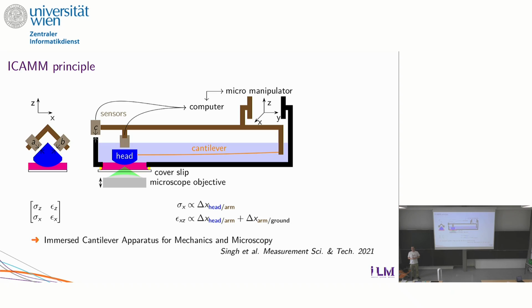A rheometer is usually either stress control or strain control. At least that's what they sell you. But here you can get better resolution in torque. Is that the idea? It won't be a torque. Yeah, it will be, but the resolution in stress will be more or less the same as in the rheometer, but applied on a much smaller area. And this much smaller area corresponds to where we are looking. So the stress is not distributed over a large sample that may break somewhere I'm not looking at. Okay, sure.